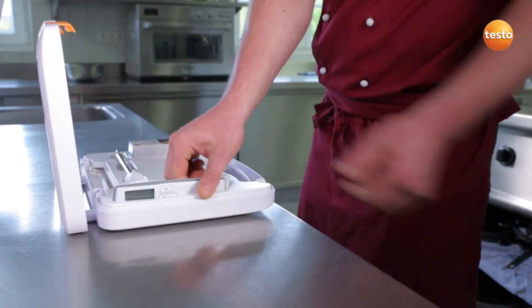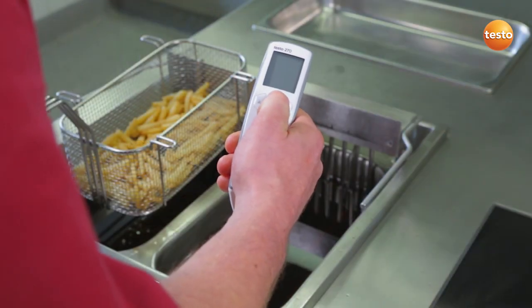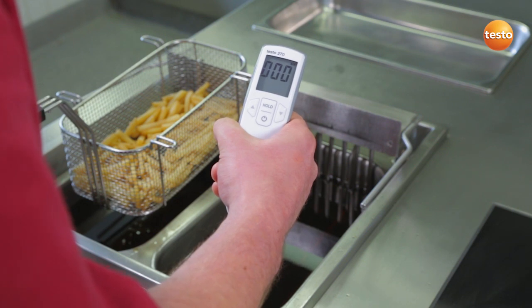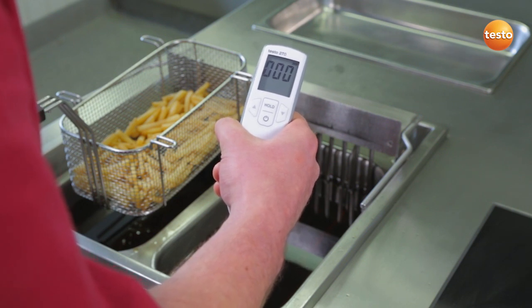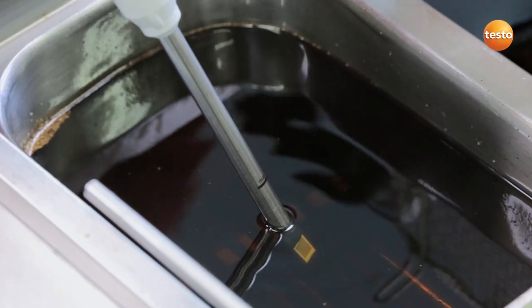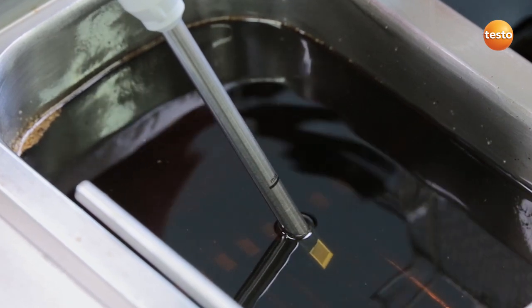This is my Testo 270. I switch it on. The cooking oil tester is in auto hold mode, which makes the measurement easier. We are ready to go. When there are no more bubbles rising, I know that there is no water left in the oil, and I can start.